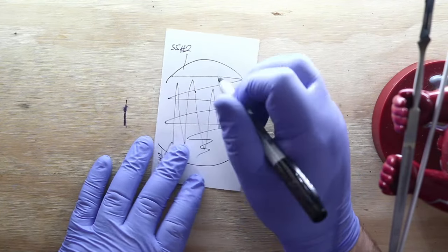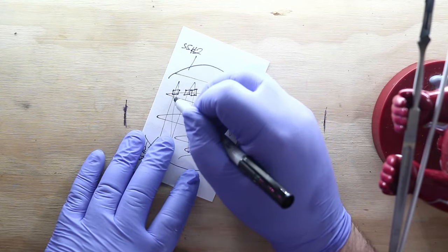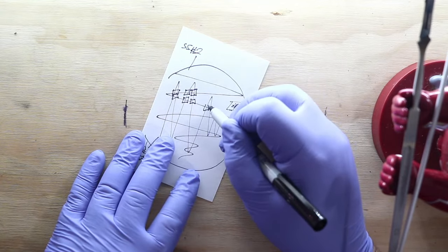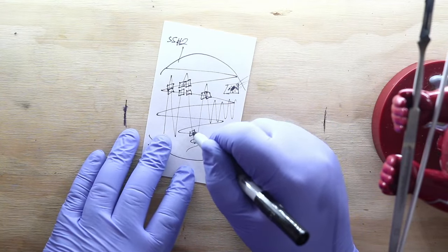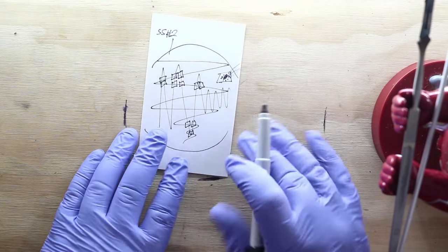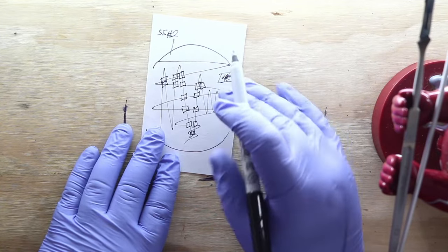So, here, here, here, there, again, just anywhere that you see your lines intersect. We could just keep going on and on, all the way down to here, cut that out, et cetera. These cut points, you can take and put on a new dish.